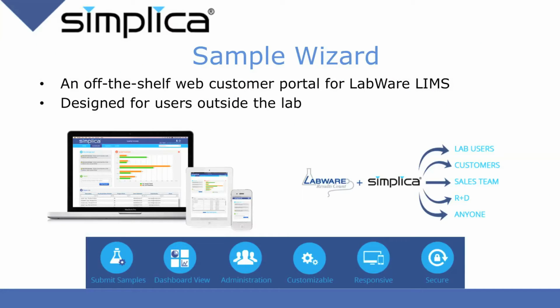Let's talk about the Sample Wizard product. What exactly is it? Well, first and foremost, it is an off-the-shelf web customer portal for Labware LIMS. Another key point is it's designed for users outside the lab.